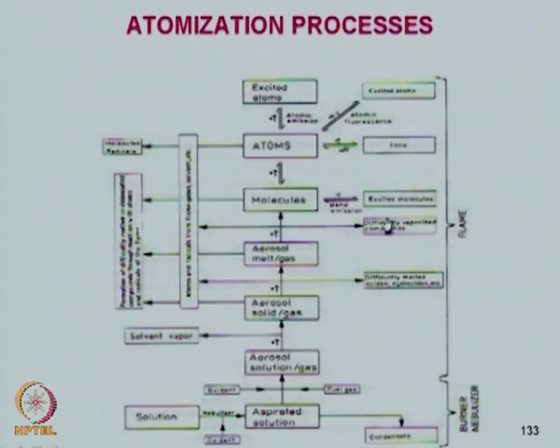And again we have substances which are very difficult to decompose and vaporize, because oxides and other things do not vaporize so easily. And there could be some substances which are more easily converted into different kinds of molecules. So, that is also not of much use.